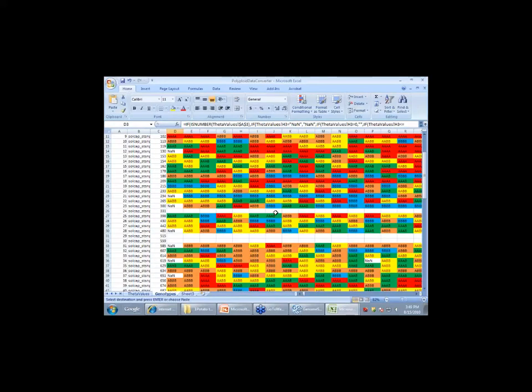Does Genome Studio compute LD? No, it really doesn't. Genome Studio is really a software package to export genotypes, and from there you import them into programs for mapping, QTL, LD and so on. For LD, we've used Structure, for example. Castle and Structure are nice programs to upload this data into, and we've actually done that already with this very data set. It works quite well.